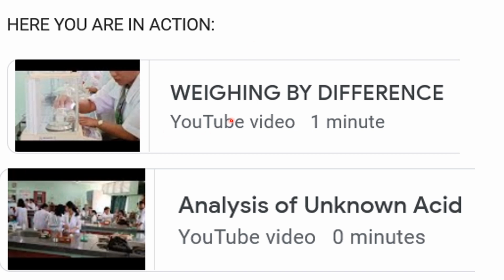This refers to the technique in massing out KHP or potassium hydrogen phthalate without putting a big glassware container inside the analytical balance. We use the KHP withdrawn from the vial to standardize the sodium hydroxide solution. Then, number 2, analysis of unknown acid. This is where you use the standardized sodium hydroxide solution to find the molar concentration of the unknown acid.